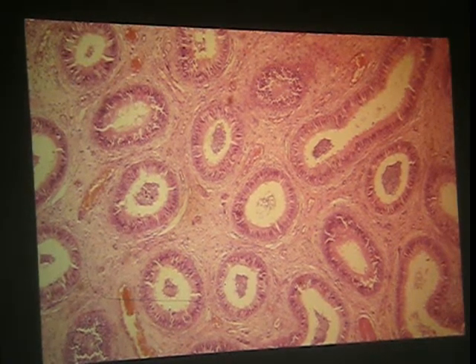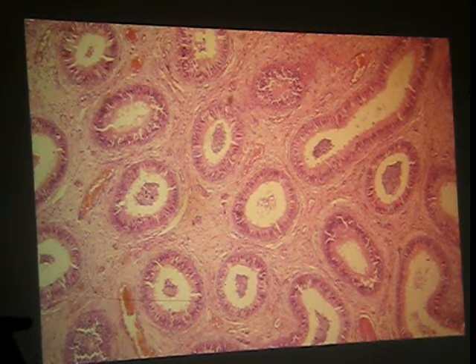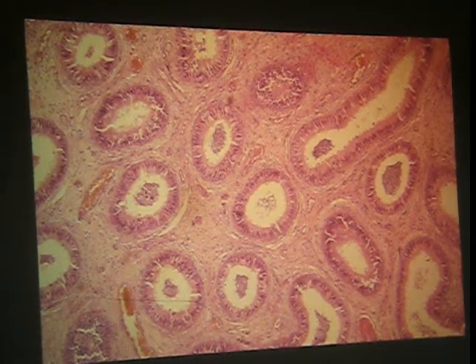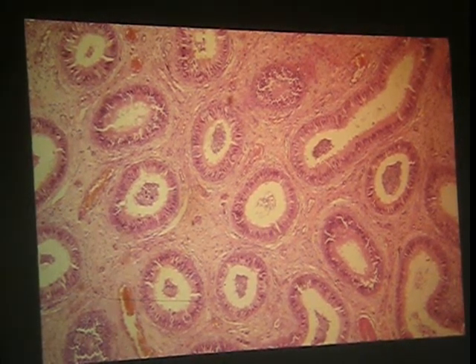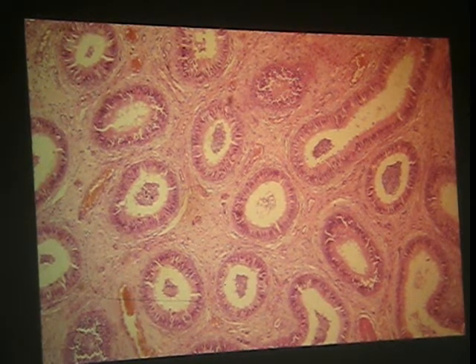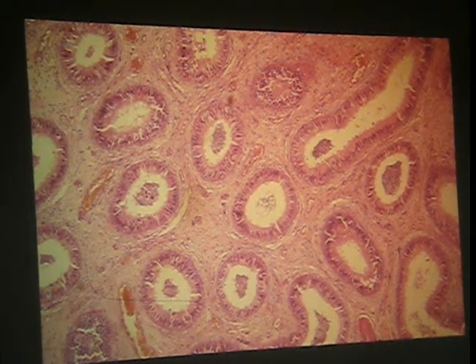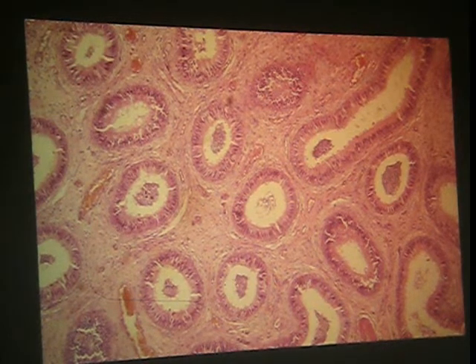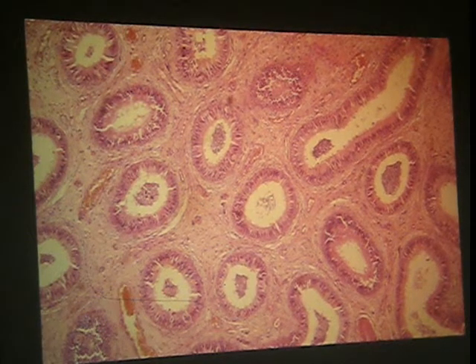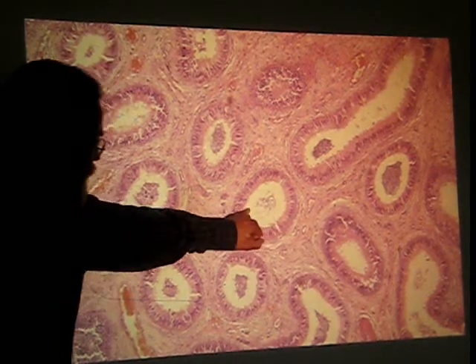When I say pseudostratified epithelium to you, probably you're thinking of respiratory epithelium, which is pseudostratified ciliated columnar. Right? So it's a tall kind of epithelium. In the epididymis, we have a pseudostratified columnar epithelium, but it's not ciliated, it's stereociliated. And that's kind of a funky term. It basically means that it's an immotile cilium, which is kind of a contradiction. It's better to think of it as a long branched microvilli. All right? So that's what you're seeing here, this little crew cut factor.